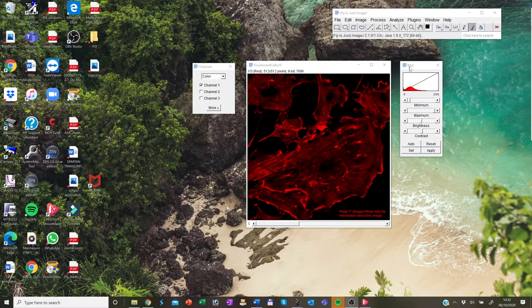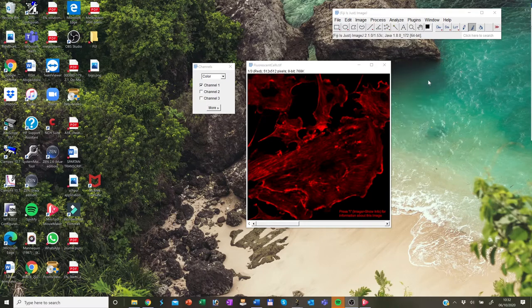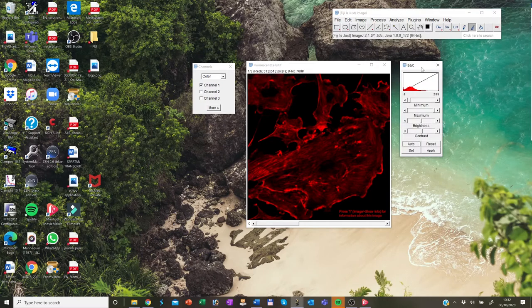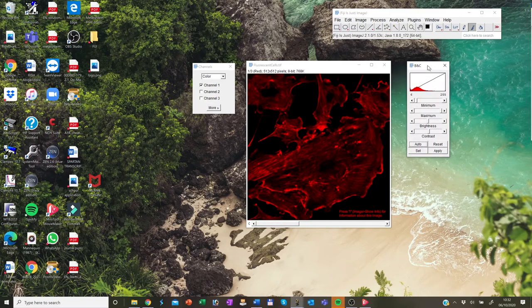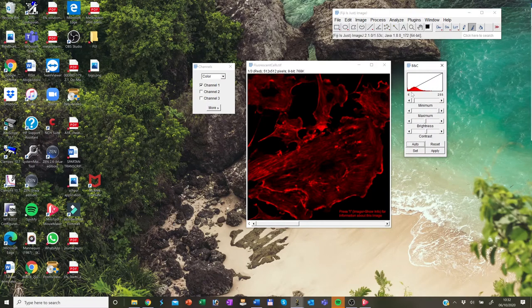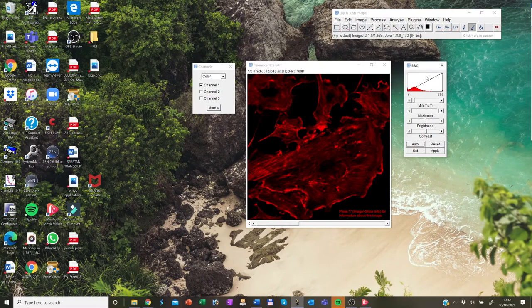This brightness and contrast window can also be opened by a different route where you click on shift C and it immediately opens up.